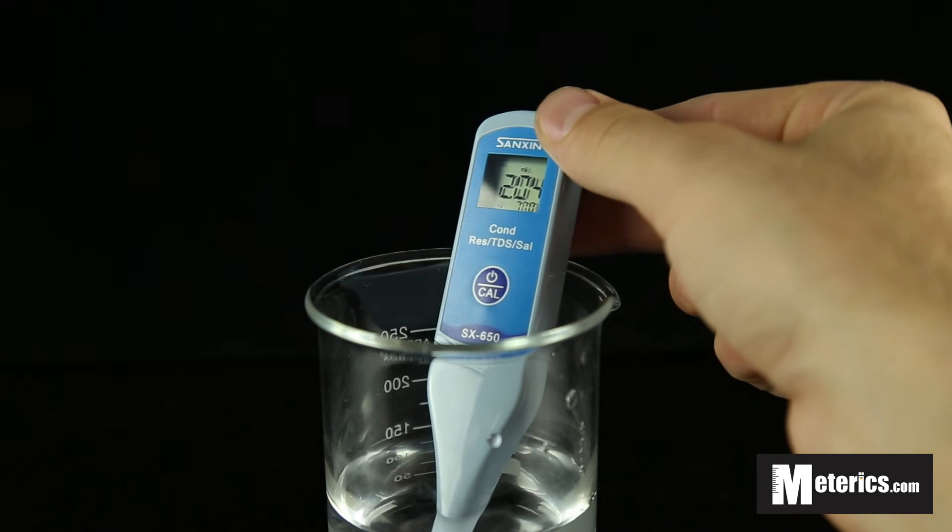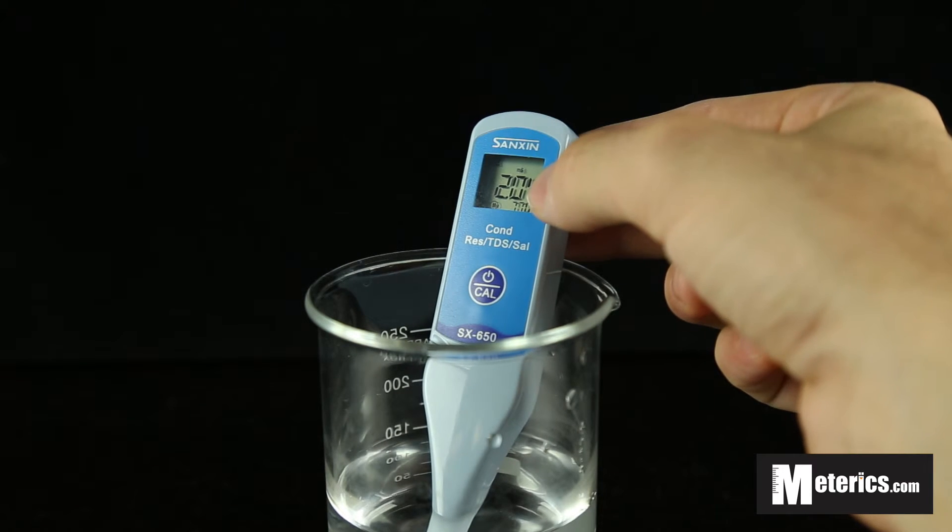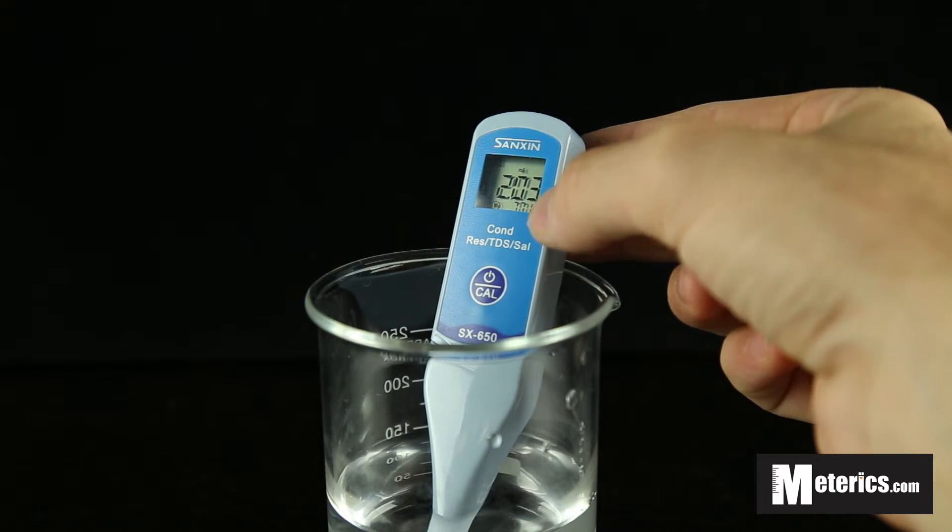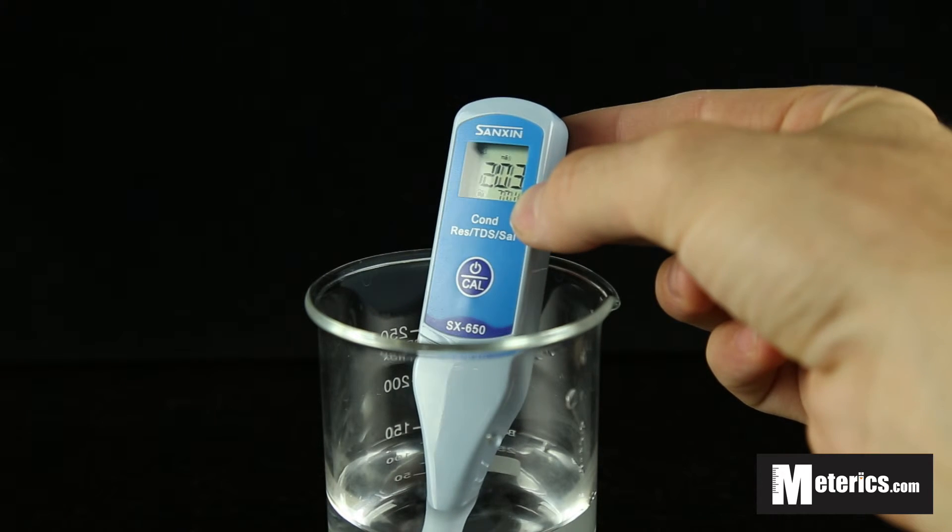As you can see, it's very easy to operate. You've got your measurement right here, and then down below, a little bit smaller.